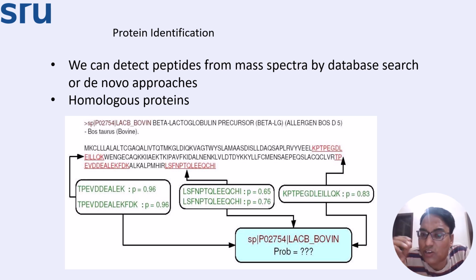So in such a large number of sequences, only one chance will be there that you will get a fragment like this. See, such a high improbability is there that even when the probability is 0.65, 0.76, I still consider it to be statistically correct. Are you understanding? Just correlate the part.